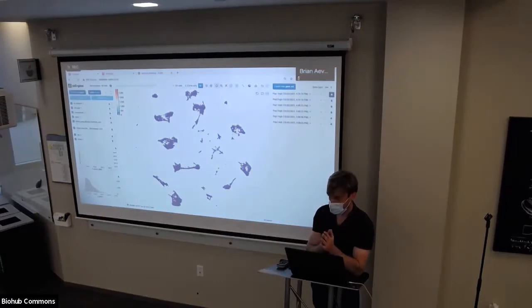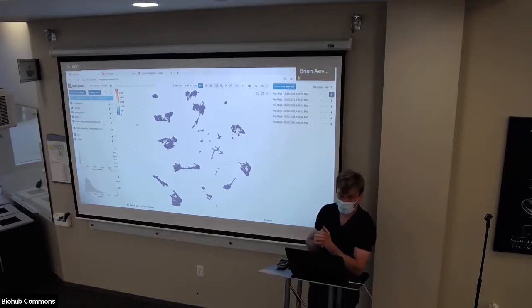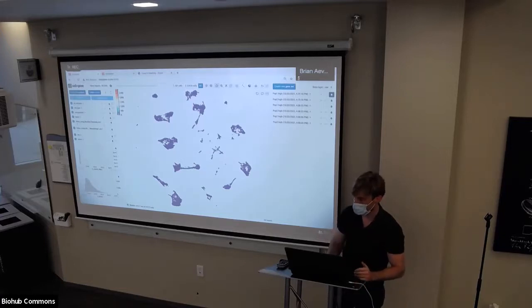And so I think with these sets of tools and your suggestions, we now have a tool where Merlin or anybody who is intensively analyzing giant cell atlases can do every single step of the analysis pipeline using just the front end. And it's not just useful for people who don't know how to code. It's useful for anybody. Like in my PhD, I developed a much more rudimentary version of this GUI, and it dramatically increased the rate at which I can explore my data sets.